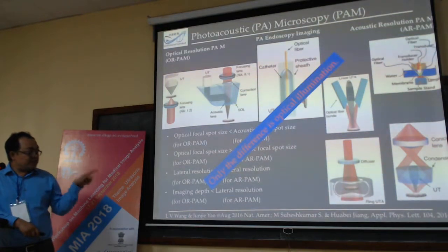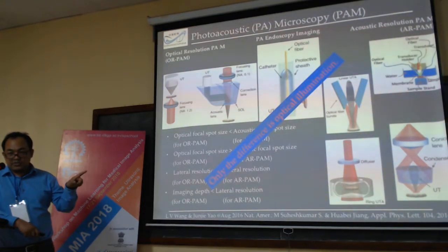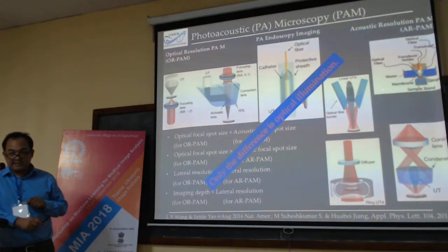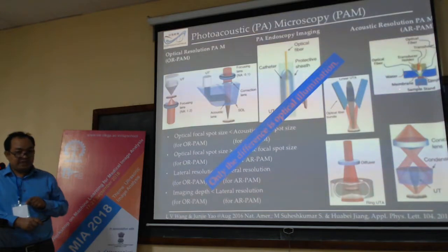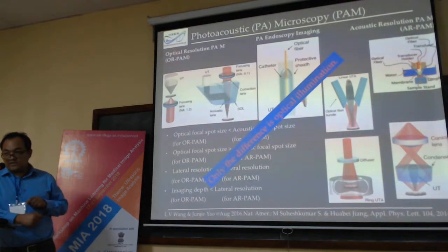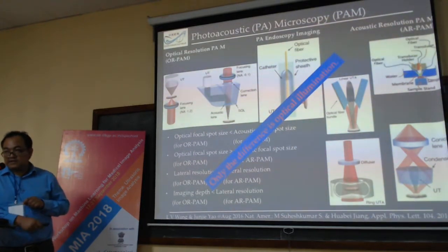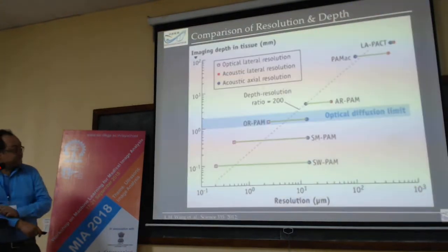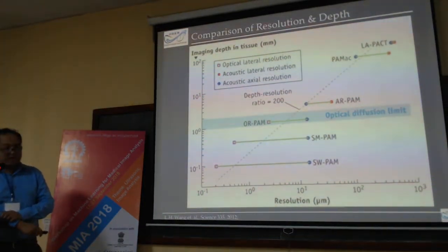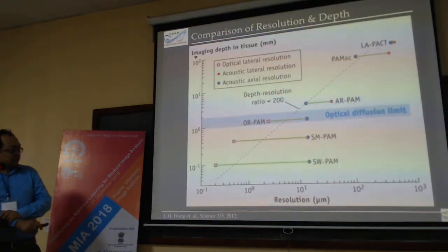When I talk about reconstruction and the design and development of the microscopy, I will discuss it with the acoustic resolution system where I did it. However, I would like to say it's the same. The only difference is how to focus the light and synchronize it together with the ultrasound and the dashboard.